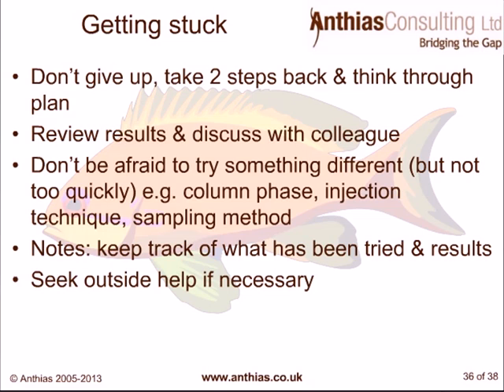Don't be afraid to try something different, but don't do that too quickly. Don't jump around different column phases, etc. But when something's not working, things like your column phase, your injection technique, your sampling method, go back and think of trying something different. Make sure that you write notes. Keep track of what has been tried and the results, and if necessary, seek outside help.